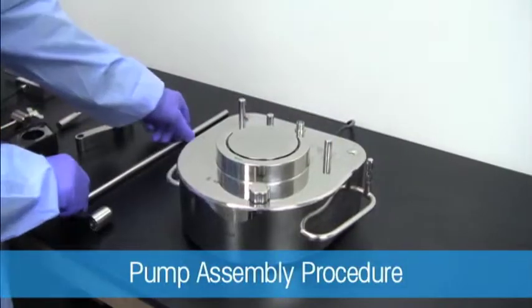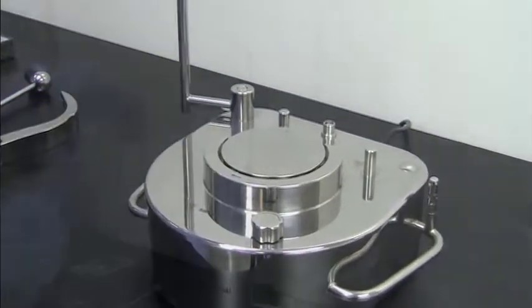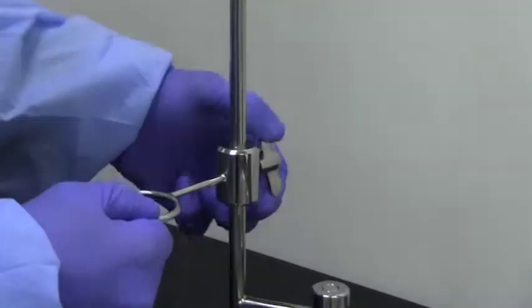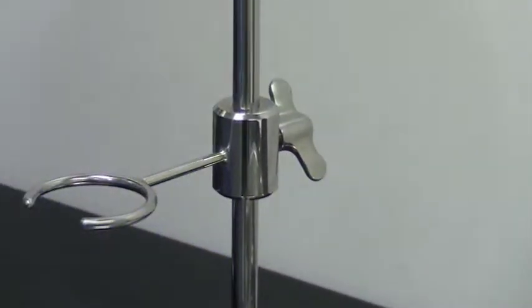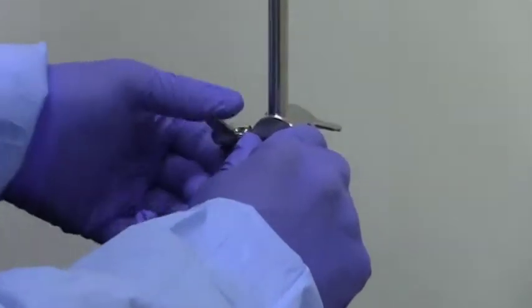To begin, attach the stand to the pump housing. Next, attach the bottle holding ring. Attach the control unit clamp with the convenient front symbol facing forward.